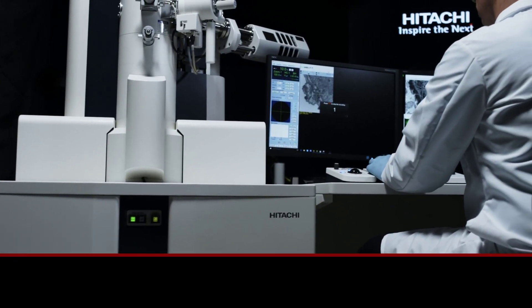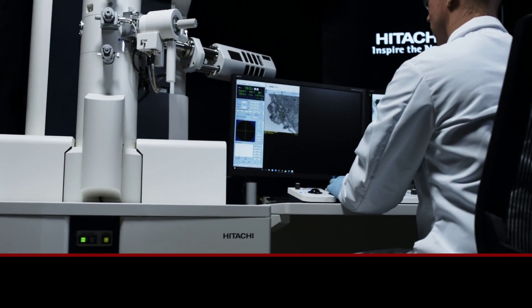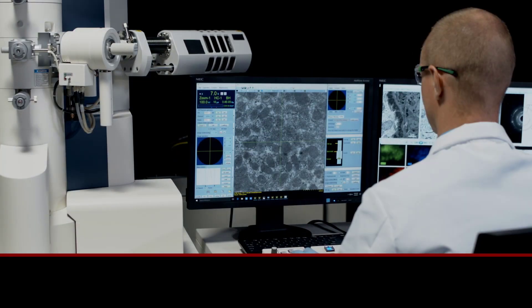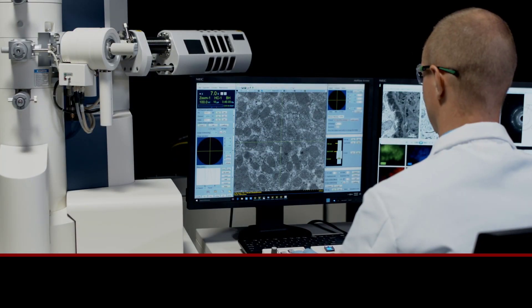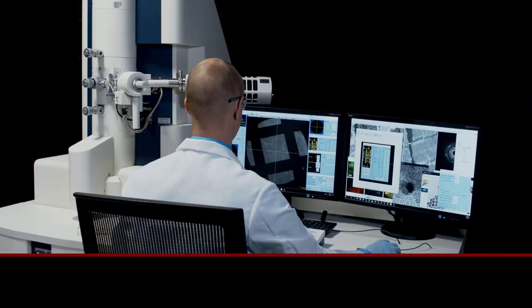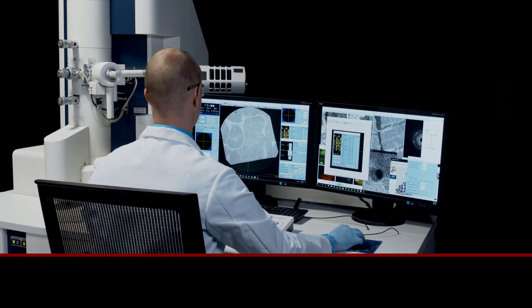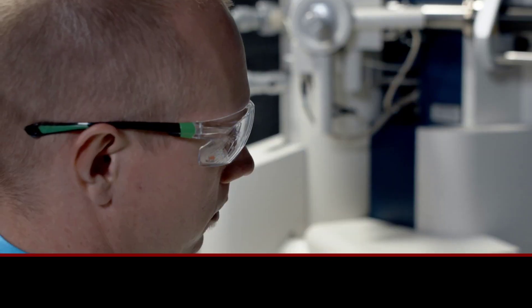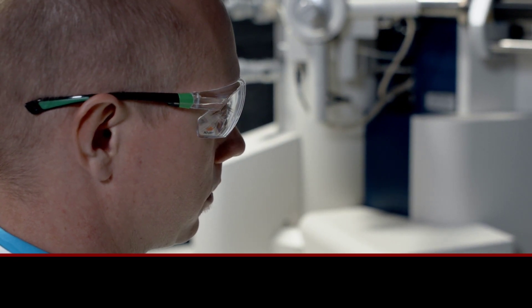With ergonomics and efficiency in mind, operating in a dark room is a thing of the past. The innovative design layout of the HT7800 not only improves posture and safety by locating the operator in front of the workstation versus the electron column, but also reduces eye strain by keeping the room lights on.